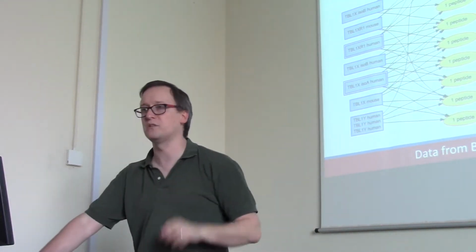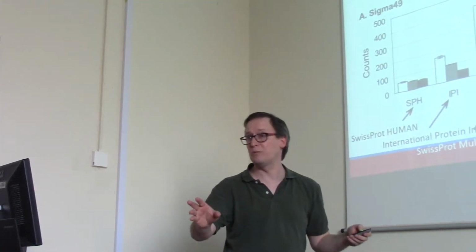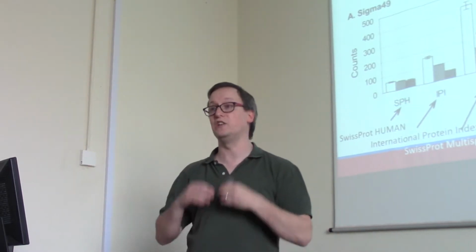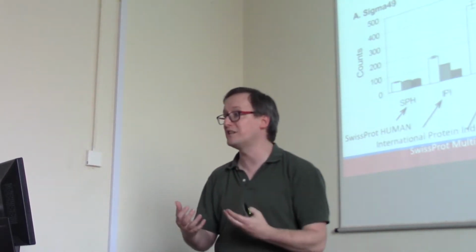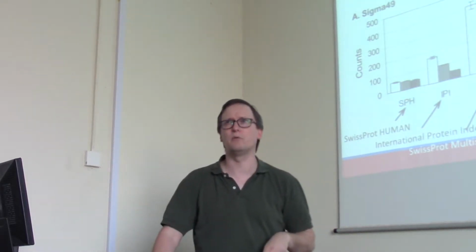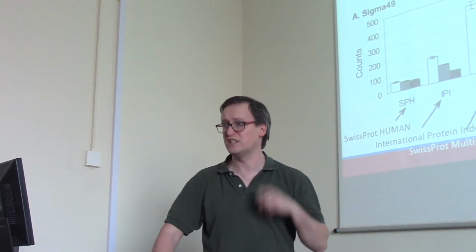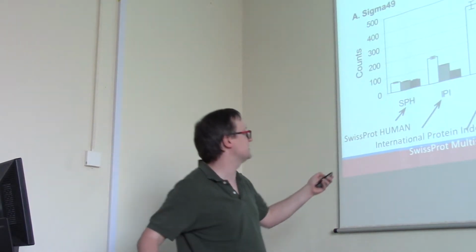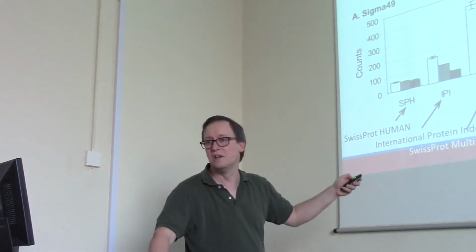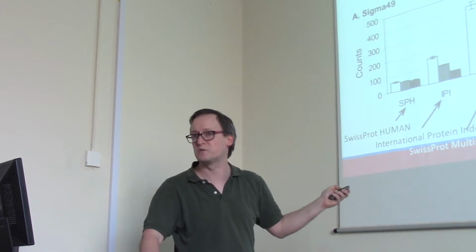Okay, so that's parsimony. Does it in practice have a big effect? Well, I mentioned the problem with orthologs a moment ago. What happens if you use a database like UniProt or SwissProt for your identifications? Now, about the time we did this study, there were 264,000 proteins in SwissProt. So we just used that. Here's SwissProt. This is the SwissProt multi-species. For part of this, we yanked out only the human proteins from SwissProt.